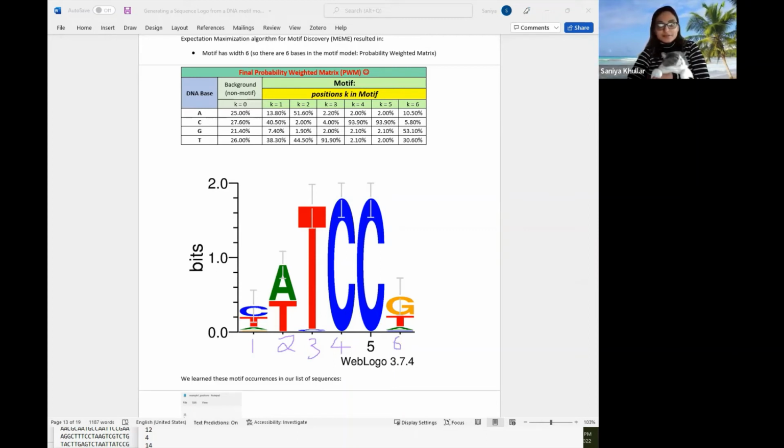So we had gone through and identified the maximum. The maximum is here, and then here, but not by too much. Here, here, and here. Sorry, the color is not so great, but we can see here that the maximum is a C.